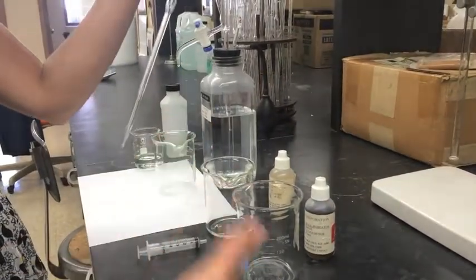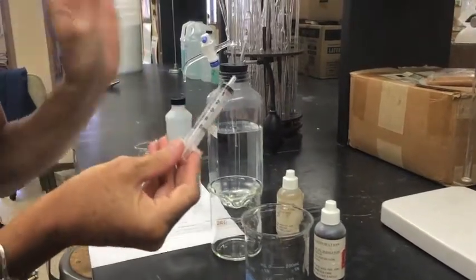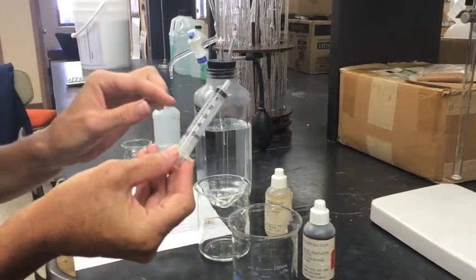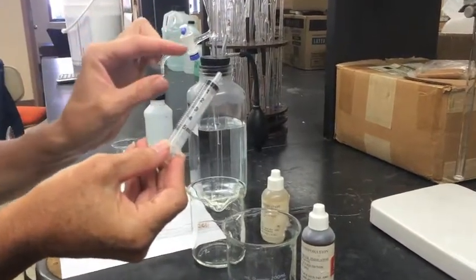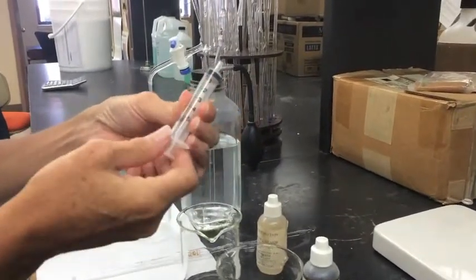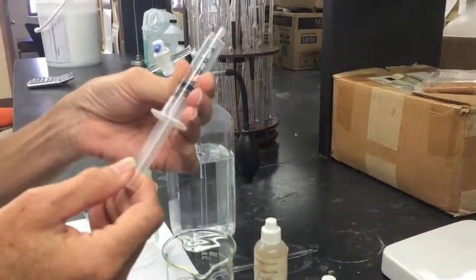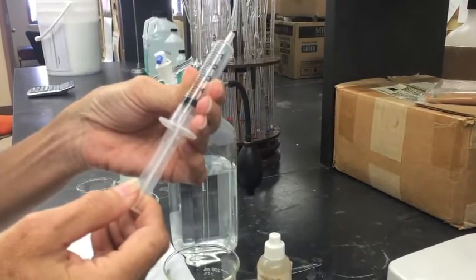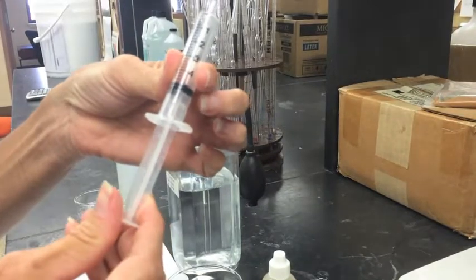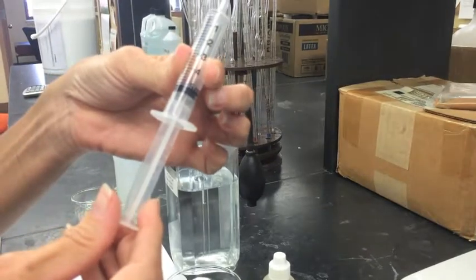If you don't want to deal with or use the glass pipette, you can use a plastic syringe. Some of your accuracy is going to be compromised, so you have to be very careful to fill the syringe without getting any bubbles in it and to fill it to the correct mark. What you need to do when you fill is to be sure that that black plunger goes exactly to the 5 mil mark. This is less than 5 mils.